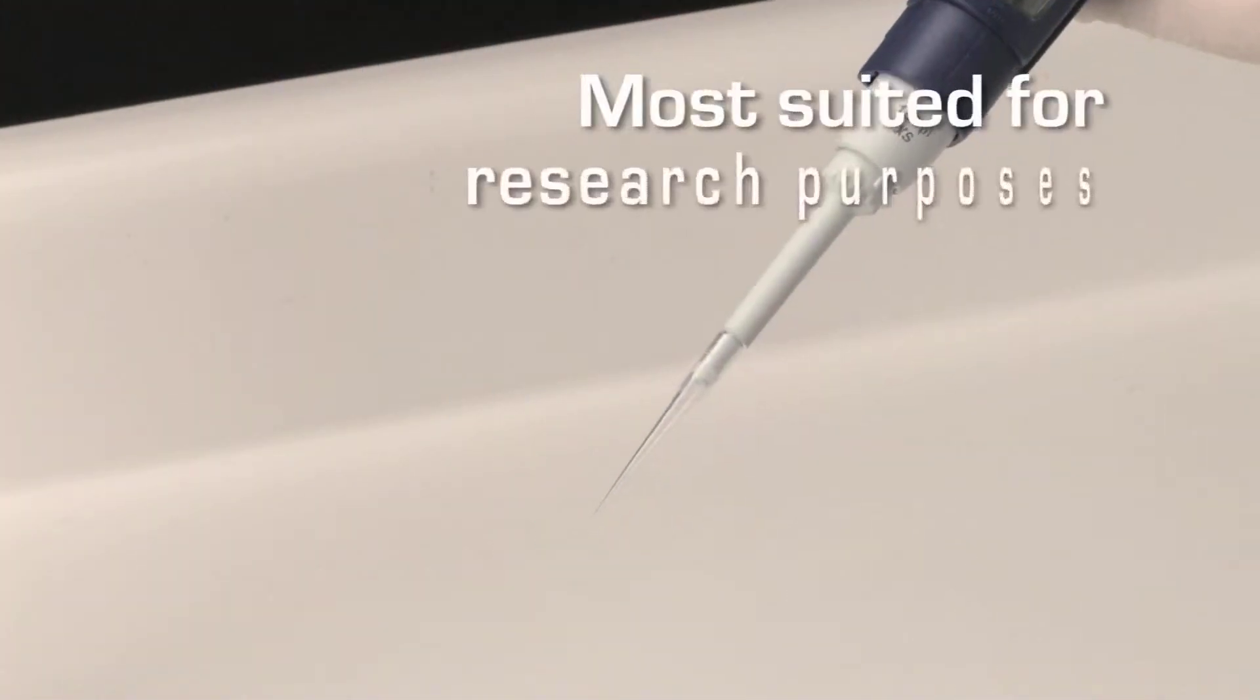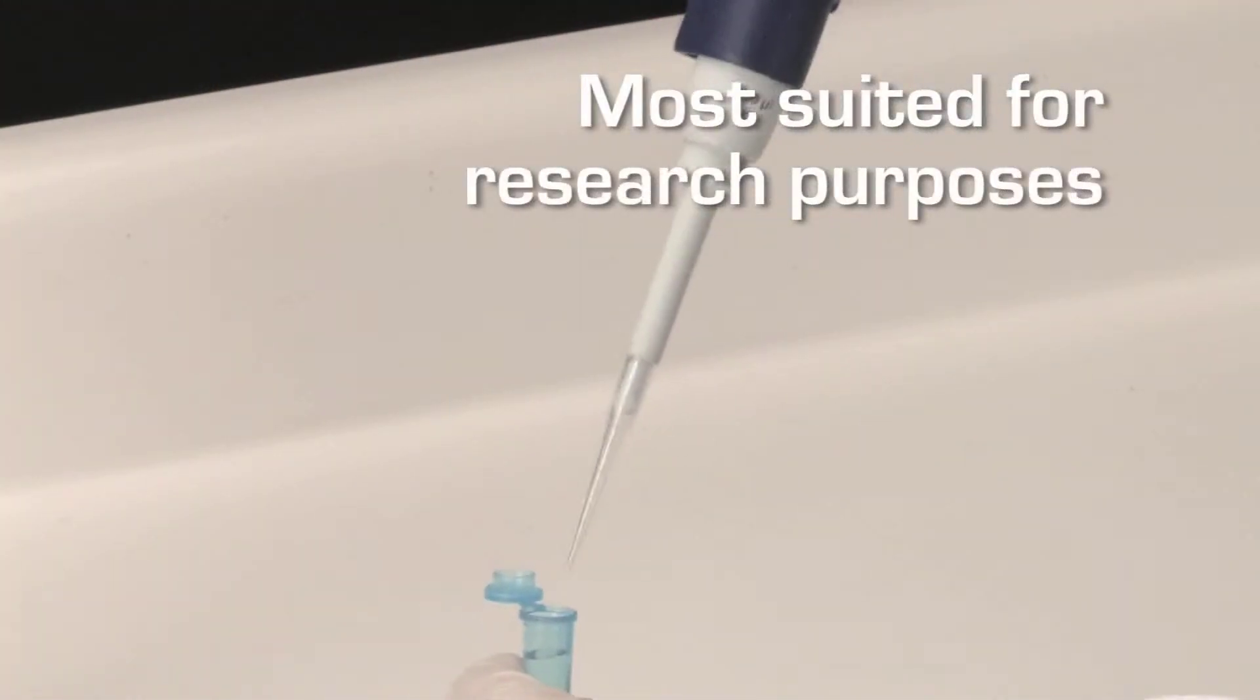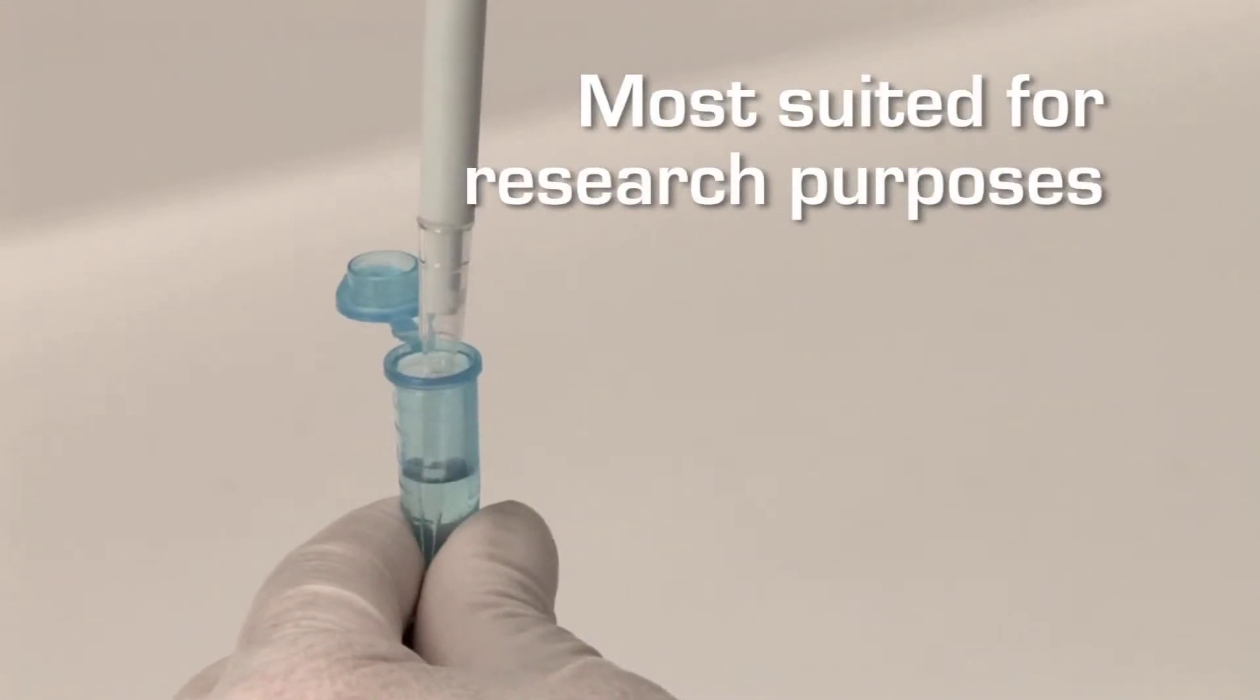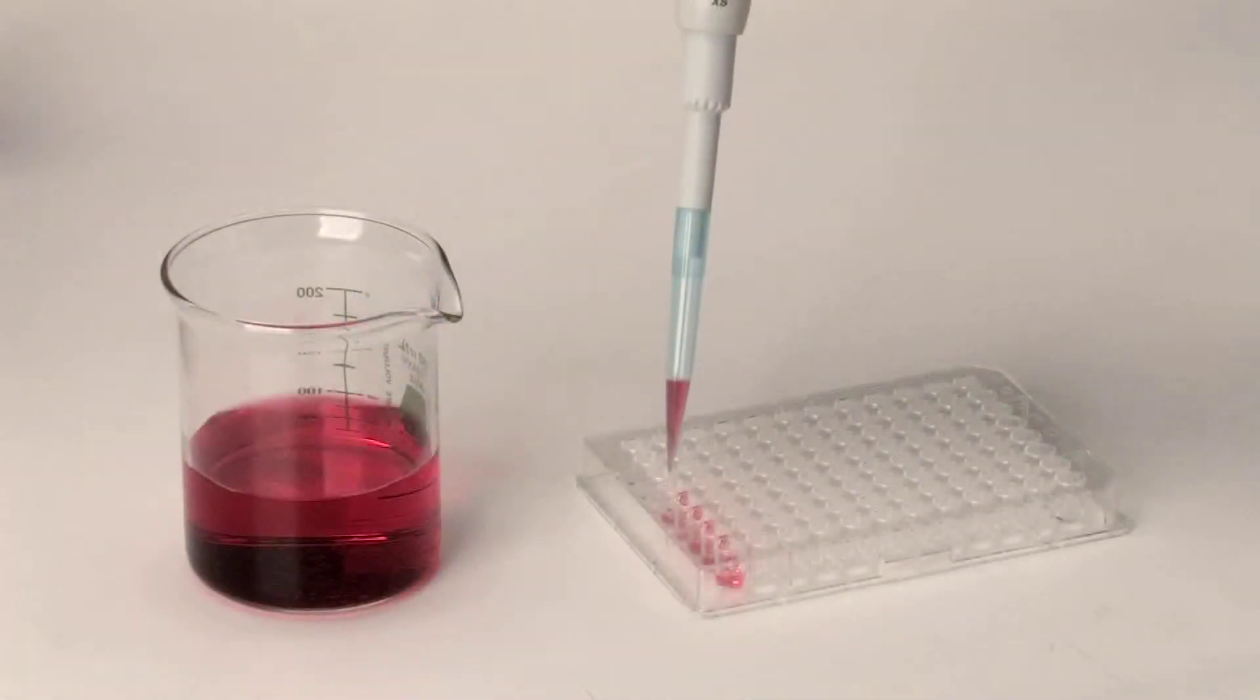The reduced shaft length and conical end of the 926XS improves drivability and access to small microtubes and microplates.